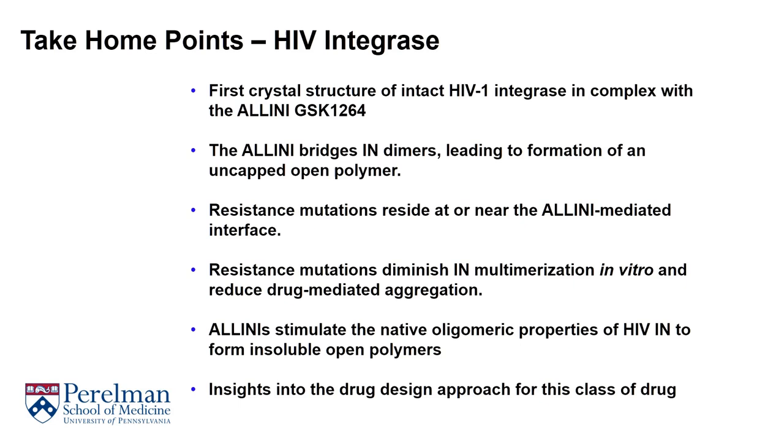These mutations also diminish integrase multimerization in vitro and reduce drug-mediated aggregation. ALLINIs stimulate the native oligomeric properties of HIV integrase to form insoluble open polymers. These results together provide insights into drug design approaches for this new class of drugs just entering clinical trials.